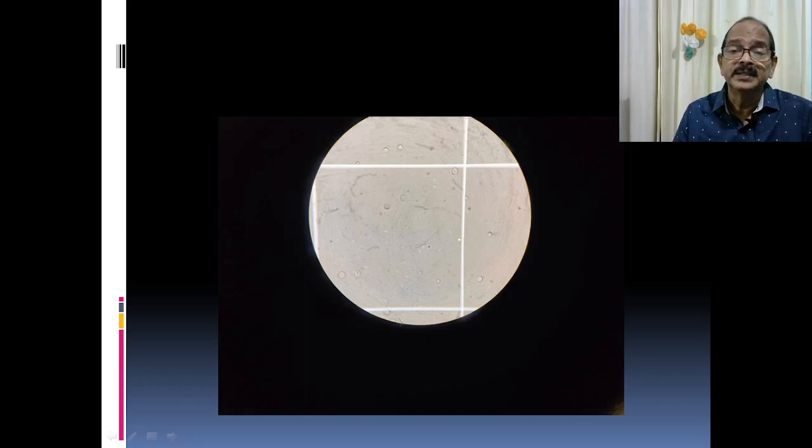After counting, check under the microscope at high power. You can also use oil immersion at 100x magnification. The morphology can be assessed, and if possible, a gram stain can also be easily done from the bedside.